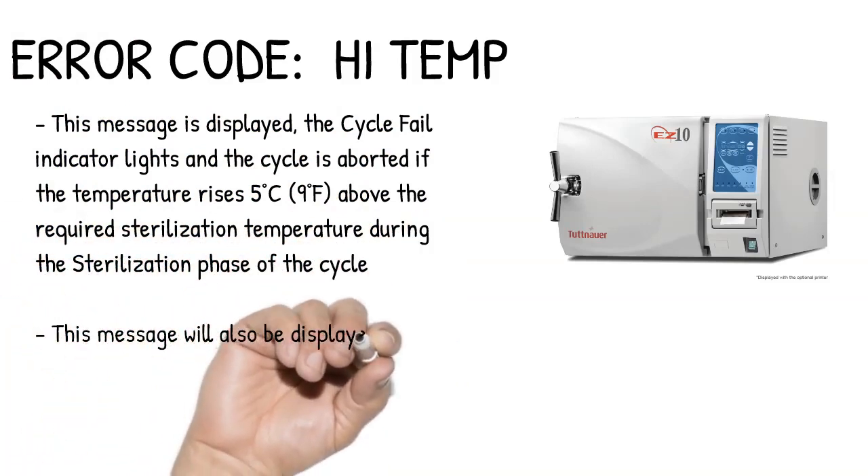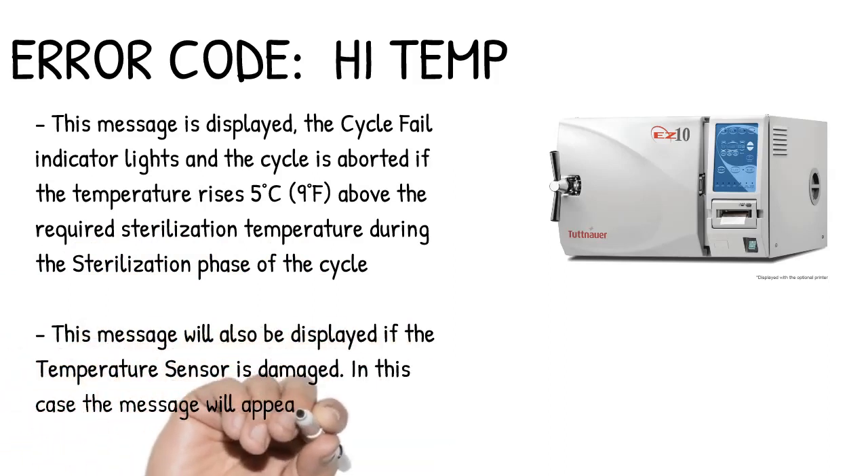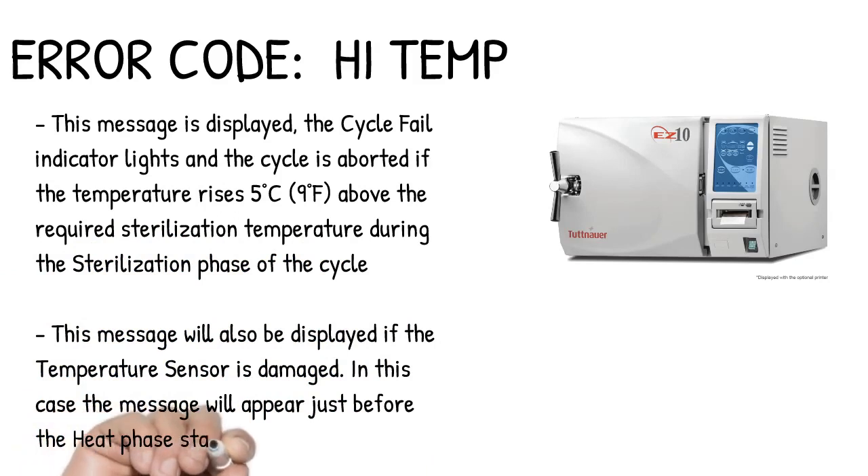This message will also be displayed if the temperature sensor is damaged. In this case, the message will appear just before the heat phase starts.